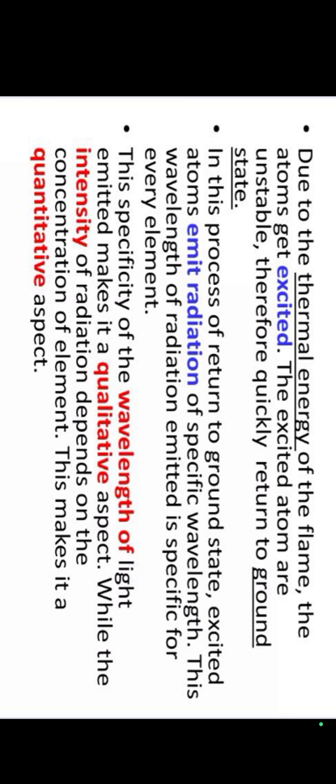Due to the thermal energy of the flame, the atoms get excited. These excited atoms are unstable, so they quickly return from the excited state to the ground state. The excited atoms emit radiation of a specific wavelength. This wavelength of radiation emitted is specific for every element.